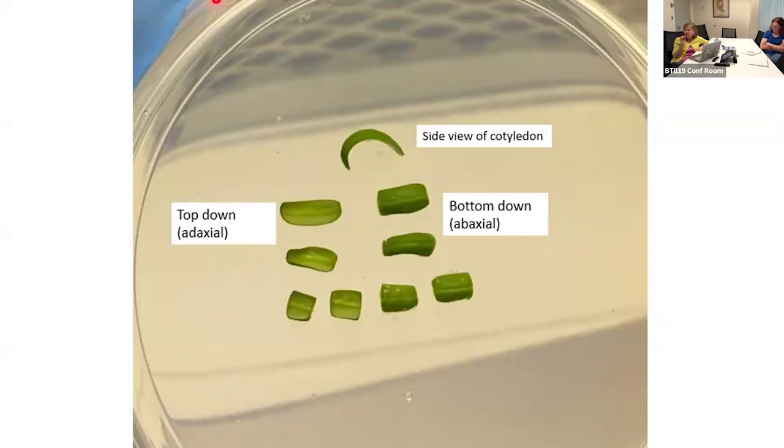With plant tissue culture, you can often have problems with condensation depending on where the plates are. And this particular chamber, it might have been by Percival, was specifically made for plant tissue culture to get around that condensation issue.